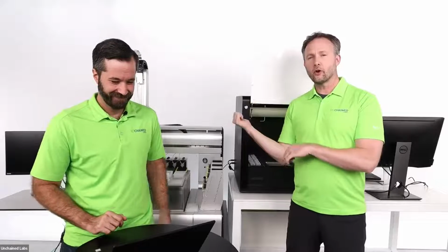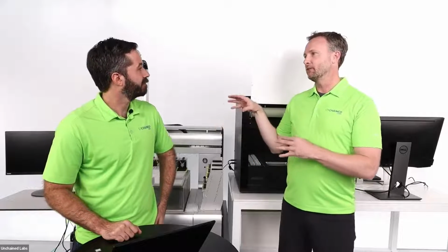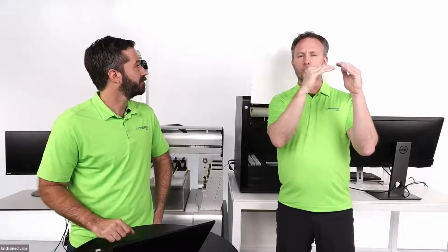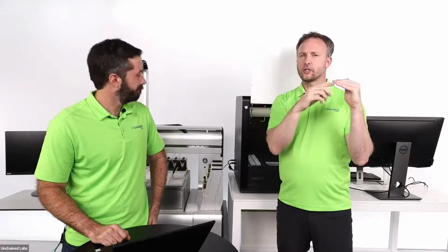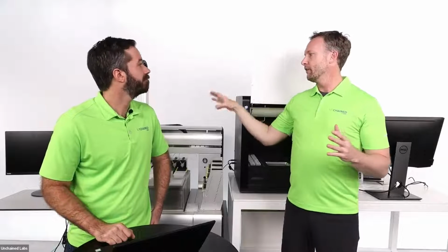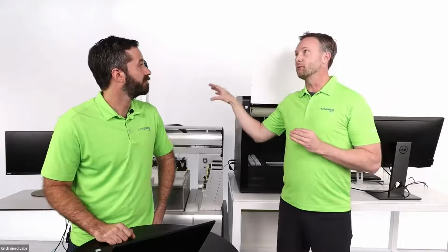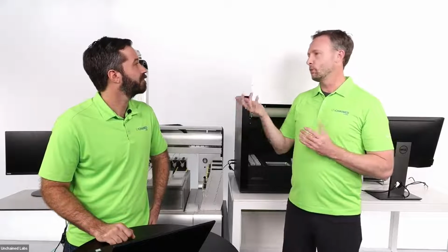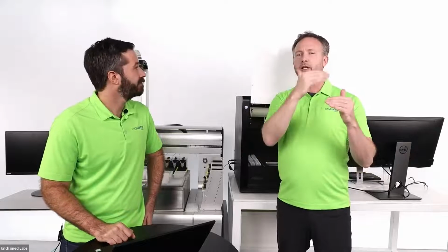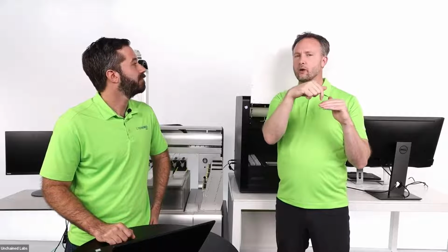So if you either enter the wrong volume that you didn't pipette in there, or perhaps you made a mistake and didn't pipette enough volume, it's all going to be relative. Both Big Tuna and Unagi are going to measure that initial volume, and that becomes the reference point, if you will, for every single buffer exchange run. So let's say you entered 10% less than was actually pipetted in there. The final volumes reported in both software would be off by 10%, but it doesn't mean that, oh no, it's going to dry out or lose a sample. It sort of normalizes to what's actually read by that ultrasonic sensor. I see. Okay, that makes a lot of sense.